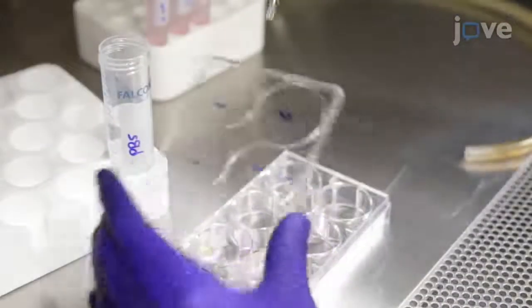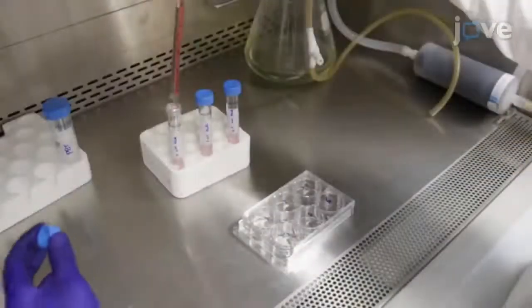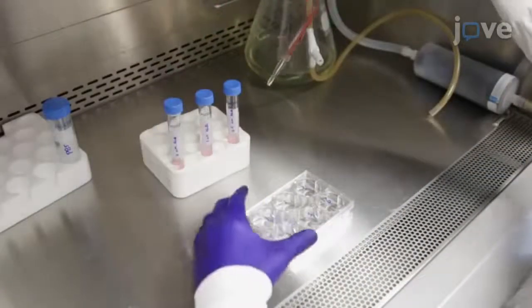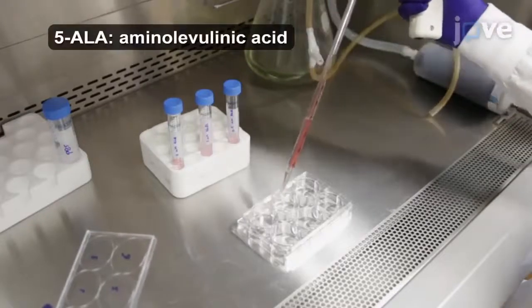The next day, wash the cells with at least 2 milliliters of PBS and treat the cultures with 0, 0.5, 1, or 2 millimolar dilutions of freshly prepared 5-ALA.